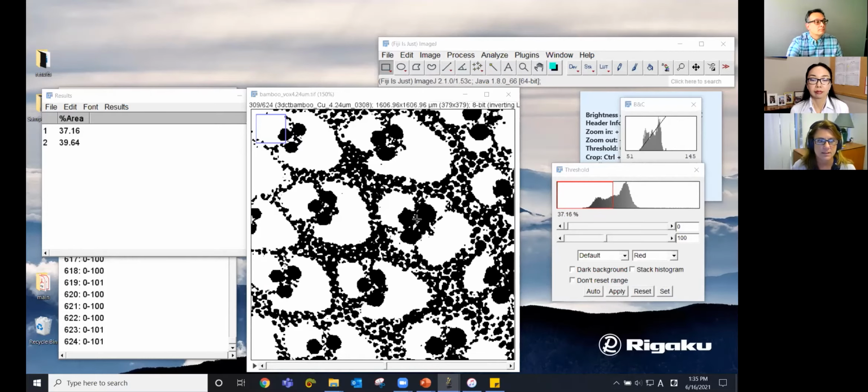So the winner in this case is to copy the plugin file to the ImageJ plugin folder. Yes, that is the correct answer. I think everybody's getting it right collectively, got all the questions right. So this is a portable program, and there is really no real installer to run, even for ImageJ itself.